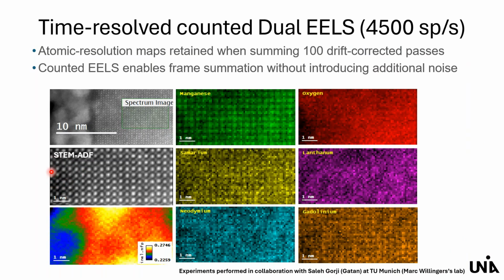Another important point that should be mentioned is that these direct detection counting cameras can be easily used to sum up the individual passes, and by summing up you will not get any additional noise. So that means there's no penalty for frame summation in this direct count dual EELS mode. This allows you to acquire the data rapidly and accumulate the signal by summing up passes as long as you want. And you can, in a post-processing step, check the first 100 frames as shown here, or also all frames, and look at the development of the sample during your measurement.